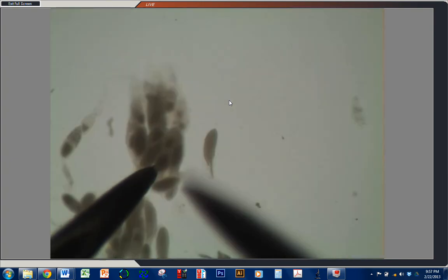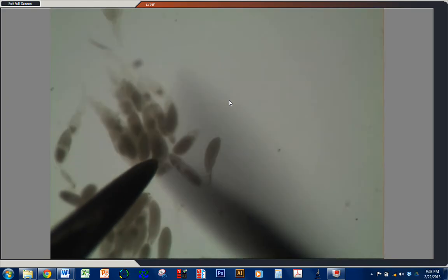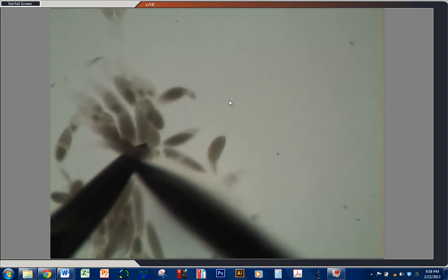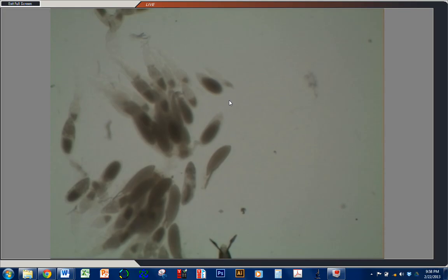Comb it down, and comb it out. There you go, you can see that they're largely individualized and ready to roll.